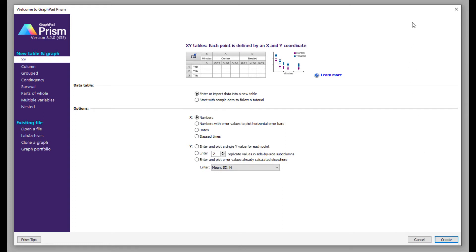The different plotting options available in GraphPad Prism are: XY, column, grouped, contingency, survival, parts of whole, multiple variables, and nested. These are the basic options that are available in GraphPad Prism.